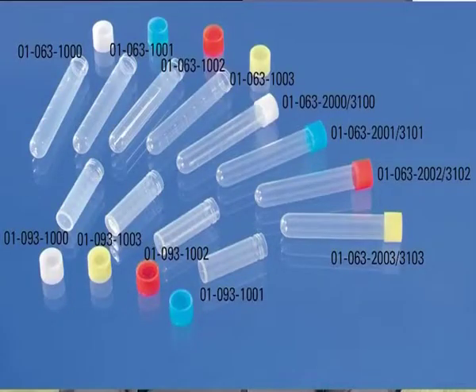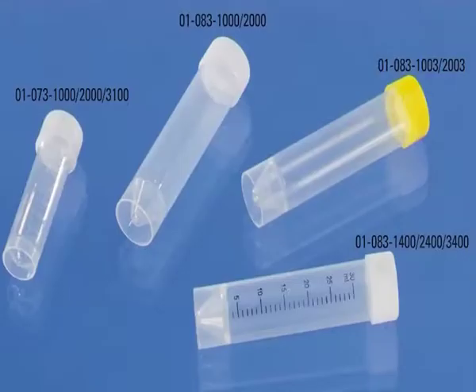Then collect each sample in separate sterile screw capped tubes or specimen cups to avoid contamination. It is important to record all the information concerning sampling, especially when different people are involved in sample collection.